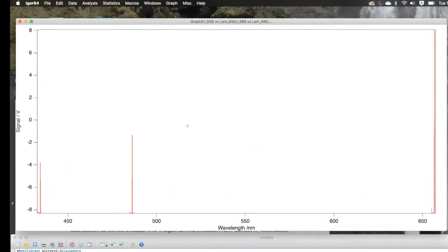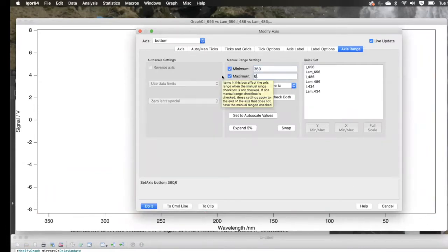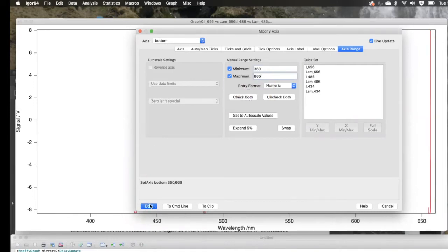We're seeing a trend here in the intensities as they're dropping off toward the blue end out here. Now, eventually, we're going to cover a whole range from the UV out to the edge of the red of the visible.